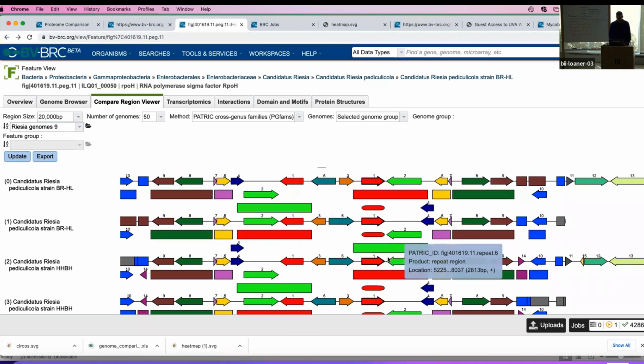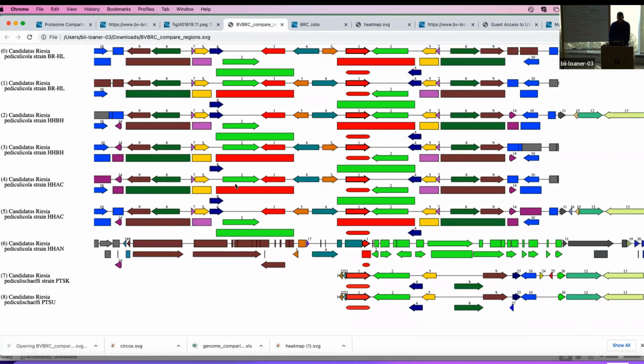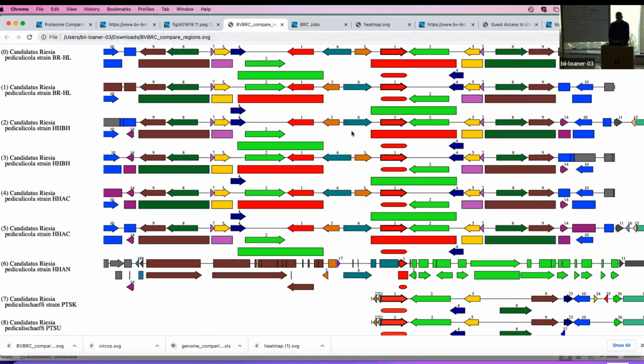And we see that a number of genomes have these repeat regions in them, which is sort of interesting. And we can see that these two guys, the order is swapping. So that's sort of interesting too. To a biologist, I presume that's meaningful. And again, into talking about doing publications, we can export this as an SVG as well. I click the export button and now it is an SVG, so I can zoom it in arbitrarily. So this could be dropped into a publication.